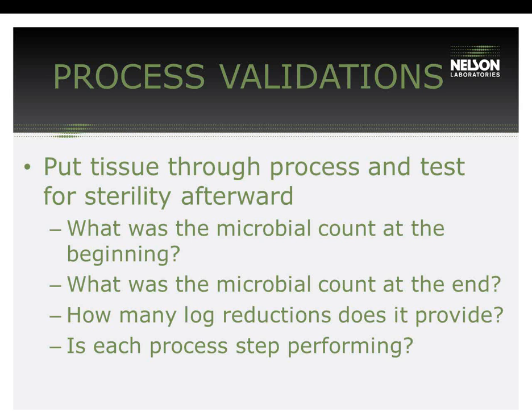The reasons for that are, to really understand what your process is capable of, you have to ask the question: what was the microbial count at the beginning on the tissue? And in most cases you don't know what that was if you're just taking normal tissue and putting it through the process. And then what was the microbial count at the end? Well, if it was sterile, if it came up with no growth, then you know that there were 0 CFU. That's a safe assumption.